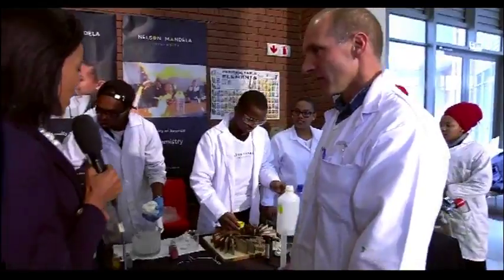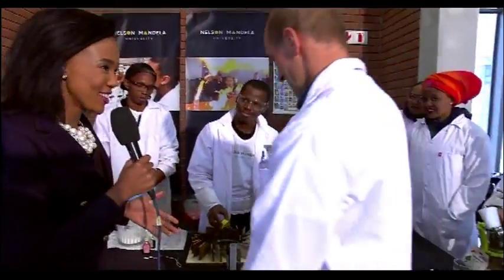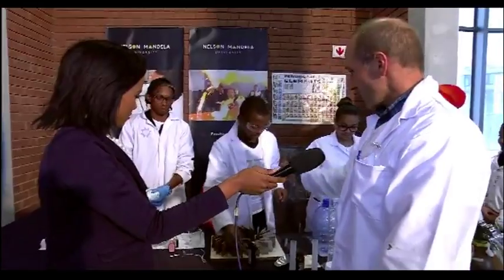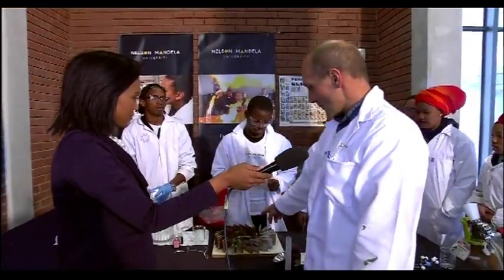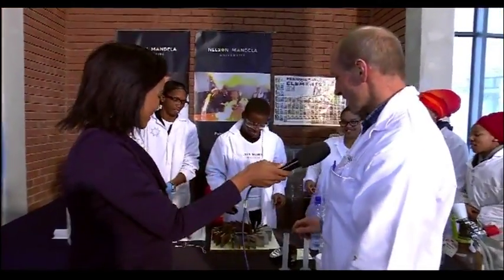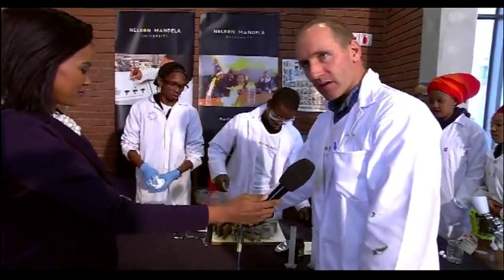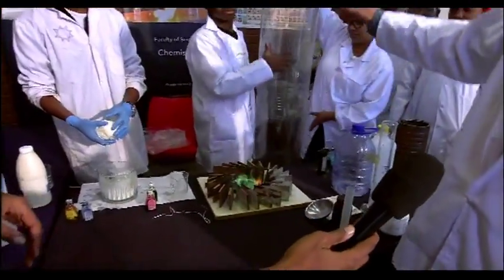Okay, this is an interesting one. The next one here, I see planks, and you actually explained to me what's going on in this one. All right, let me explain what we're doing here. Mzikisi is doing this next experiment for us. He's an analytical chemistry student. He's got some methanol. Just so nothing's going to explode here, right? Okay. This one, that might come later. He's ignited a little bit of methanol, and it's got some boric acid in, which forms that green flame we're seeing now. If you guys can maybe just put on the tower.